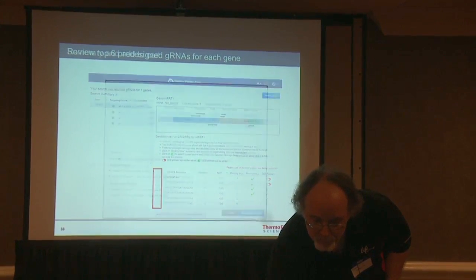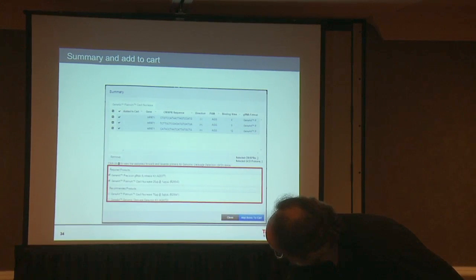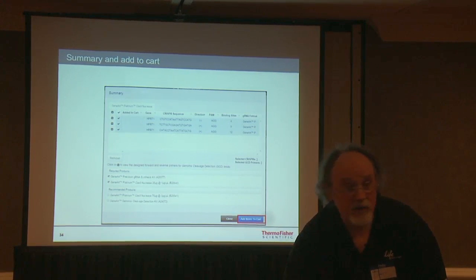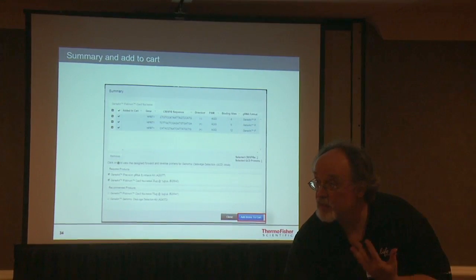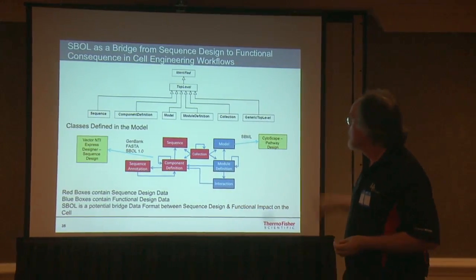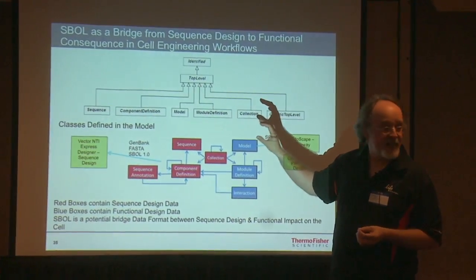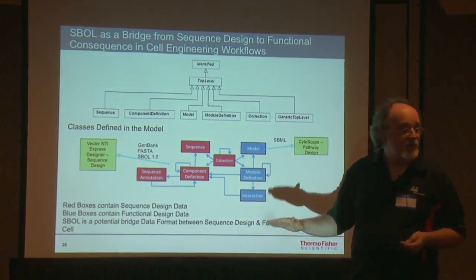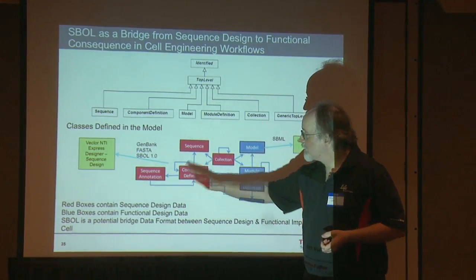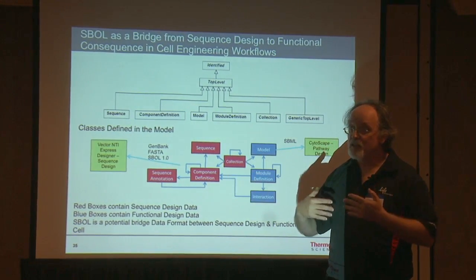Now, going through here, these are more of our assays which we're getting set up for the customer. All of this is done in an automated way. It used to involve people going to 3 or 4 different parts of our website. It's all done in one tool now. The advantage of this is that if you look at the Synthetic Biology Open Language, particularly the data model associated with it, there are a couple of very nice synergies starting to take place. SBOL supports information about the sequence and the sequence design, the thing you're actually making to put into the cell.